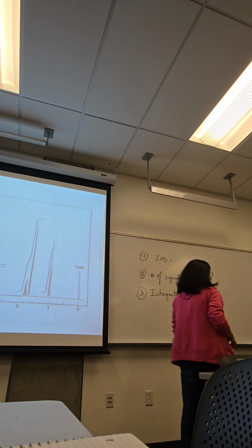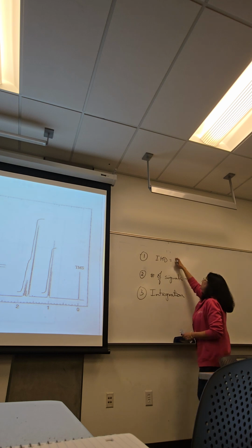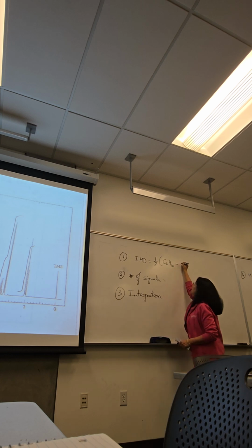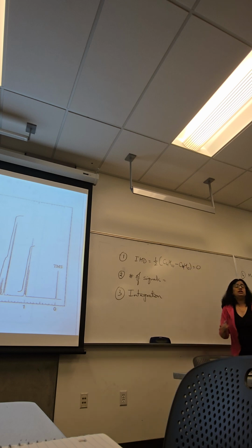So what is the IHD for this molecule? Is it 0 again? Yeah. Okay, half of C4, so C4H10 is saturated. C4H9 and Br, you're replacing the bromine with a hydrogen. Exactly. Again, meaning no pi bond, no ring. You guys with me? Yeah.